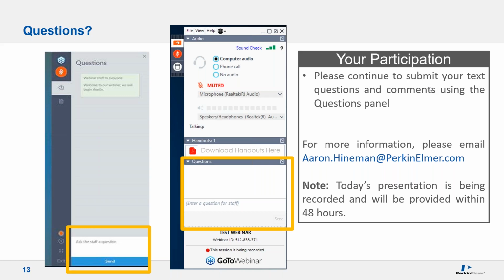There's a follow-up question to that. Is there an example you can show us that has multiple analytes of interest and multiple interferences? I don't think we have that handy, but I think that could be very useful for another webinar, to get into a little bit more complex spectra.